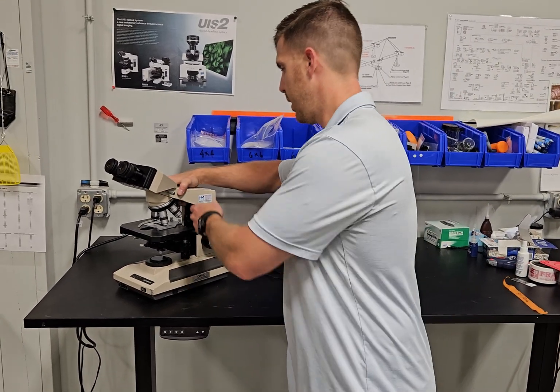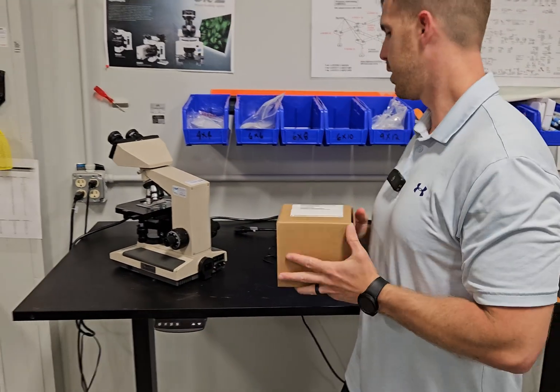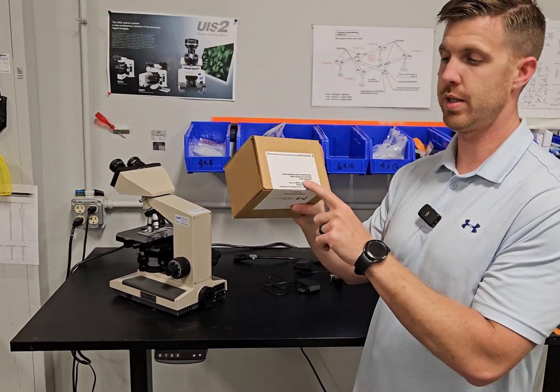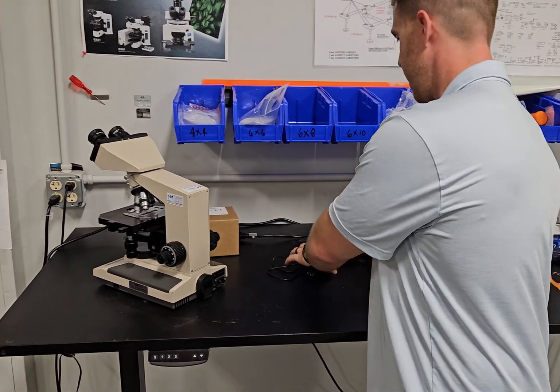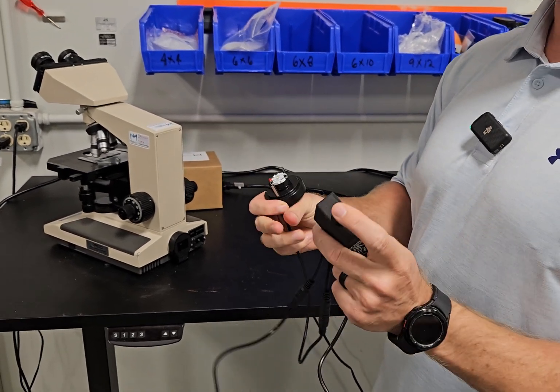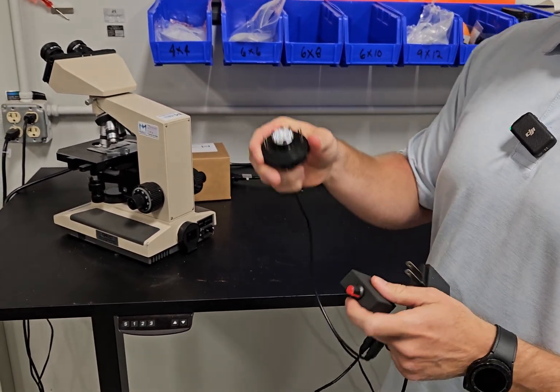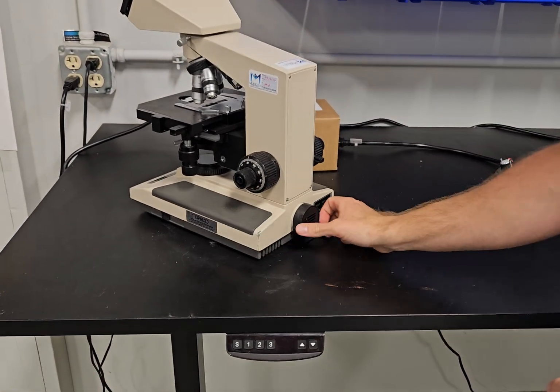We've got an LED kit and we're going to show you how easy it is to change it out whenever it ships. It's going to look like this. You're going to unbox it and then you're going to get a couple of things: a power supply, two speed connectors, a rheostat, and an LED module. This is going to bypass all the electronics in the scope.